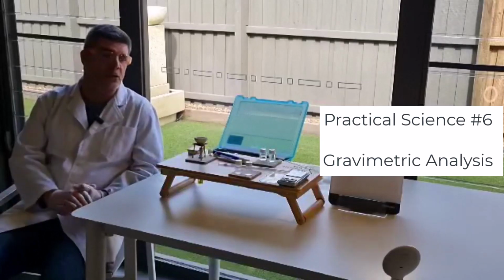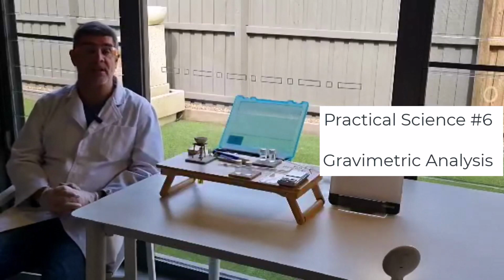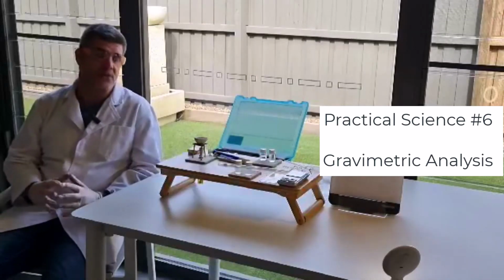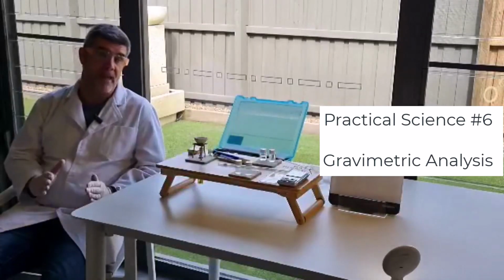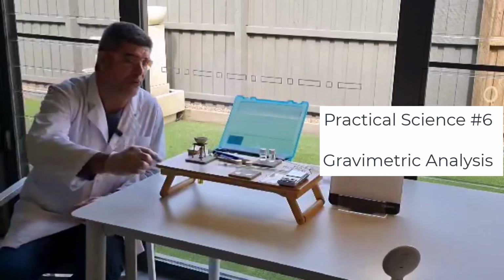Today we're going to have a look at gravimetric analysis. And gravimetric analysis is basically when we compare mixtures on the basis of their mass comparisons. So we've got 4 samples. We went and collected samples from 4 different beaches.